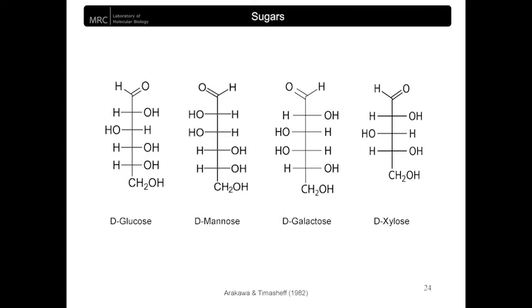Useful additives include molecules with a multitude of possible binding modes via different spatial arrangements of functional groups. Here we show Fischer projections for 4 monosaccharides and their hydroxyl groups. Sugars are well known for their thermodynamic stabilization of macromolecules. Many sugars are often seen ordered in crystal structures deposited in the PDB, although they are not frequently integrated in initial conditions.